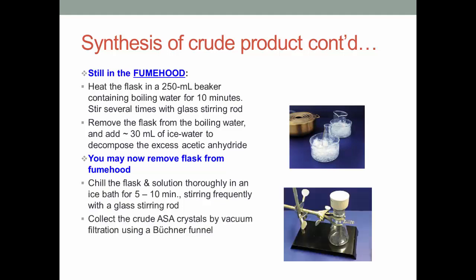Next, collect the crude ASA crystals by vacuum filtration using a Buchner funnel.